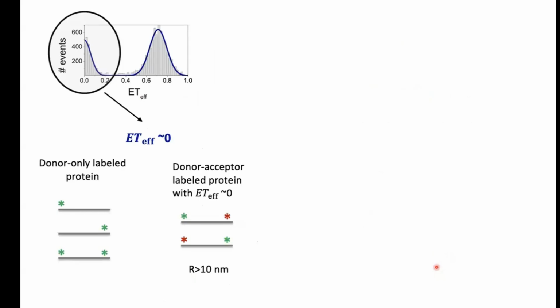So this is a simple histogram that basically has two peaks, right? You have one here that has a FRET efficiency close to 0. In most cases, remember, you have been using so far the labeling at 2 cysteines, so you have a heterogeneous sample in terms of labeling.